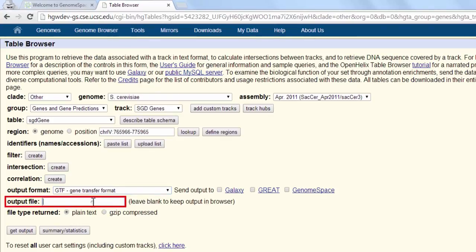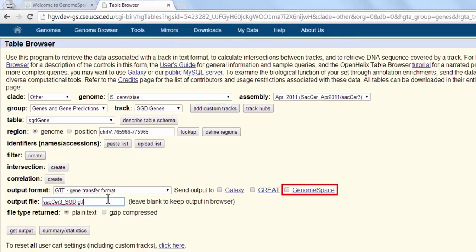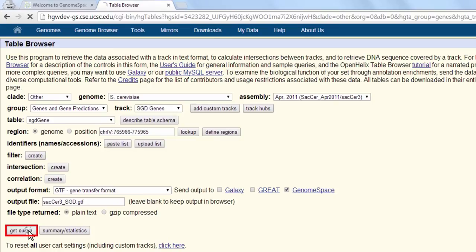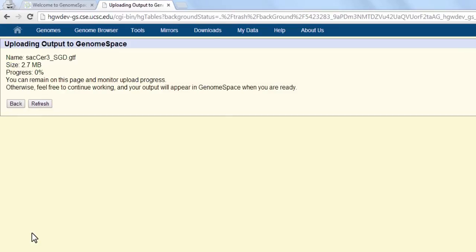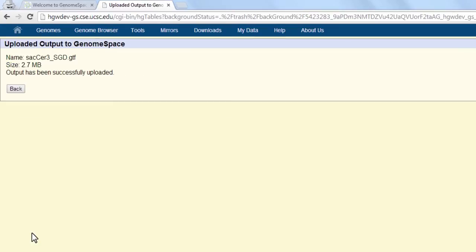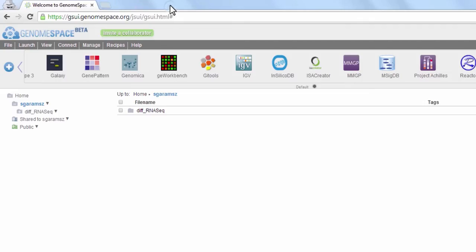Remember to specify an output file name, such as sacCer3.sgd.gtf, and to check the GenomeSpace box to direct the output to your GenomeSpace account. Click Get Output and wait for UCSC to display the successfully uploaded page.